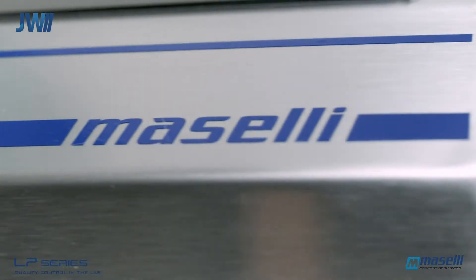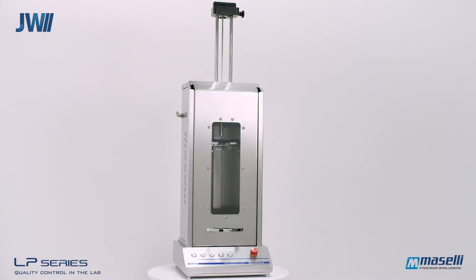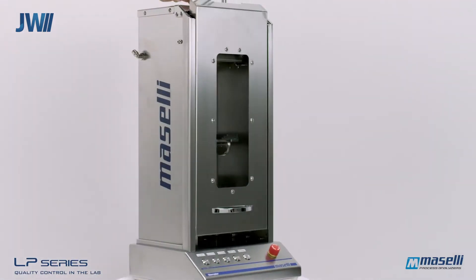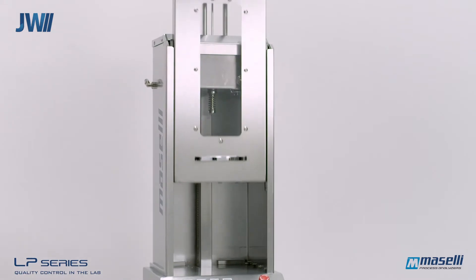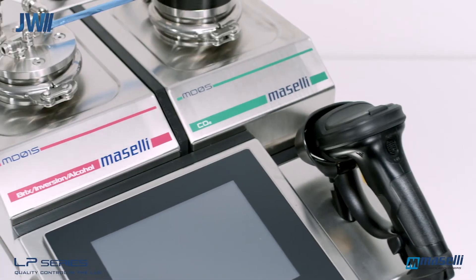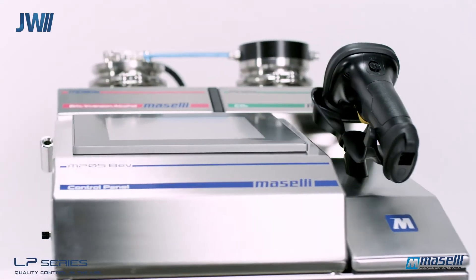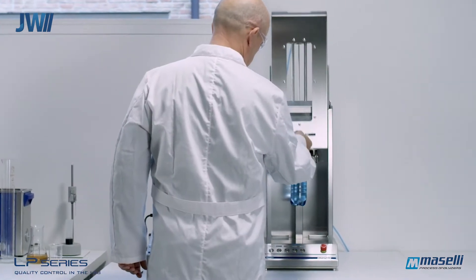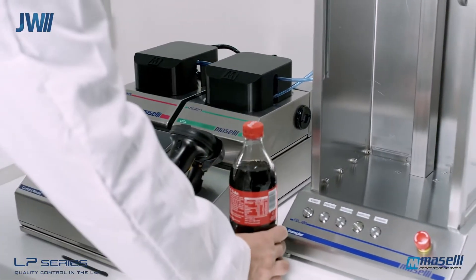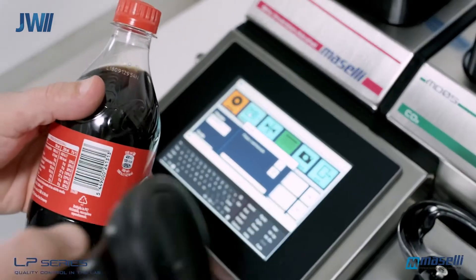JW Industrial Instruments Pty Ltd are a fully owned and operated Australian company established in 1982. We are proud to present the Maselli LP Series Beverage Analysers. The LP10 Laboratory Beverage Analyser consists of an automated package sampler, BRIX, diet module and CO2/O2 modules combined. A user-friendly and intuitive touchscreen display is used to operate the analysis modules and store historical data.